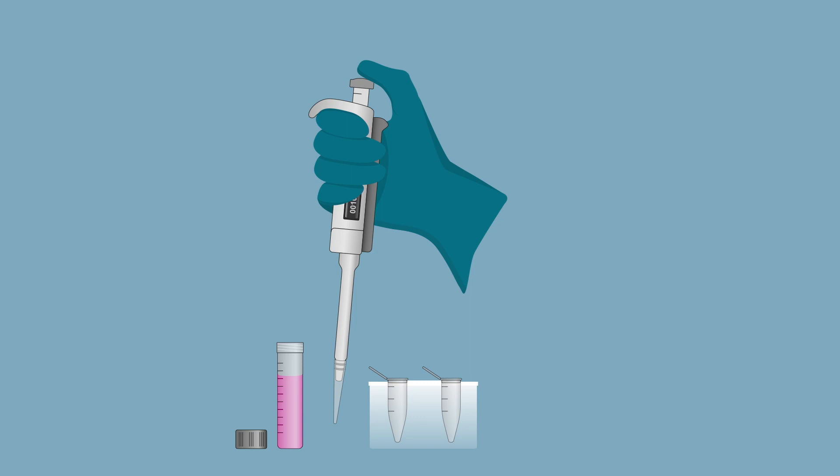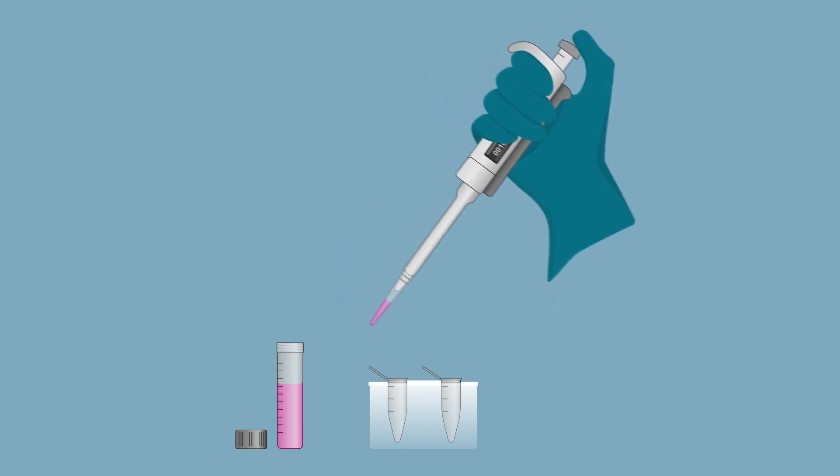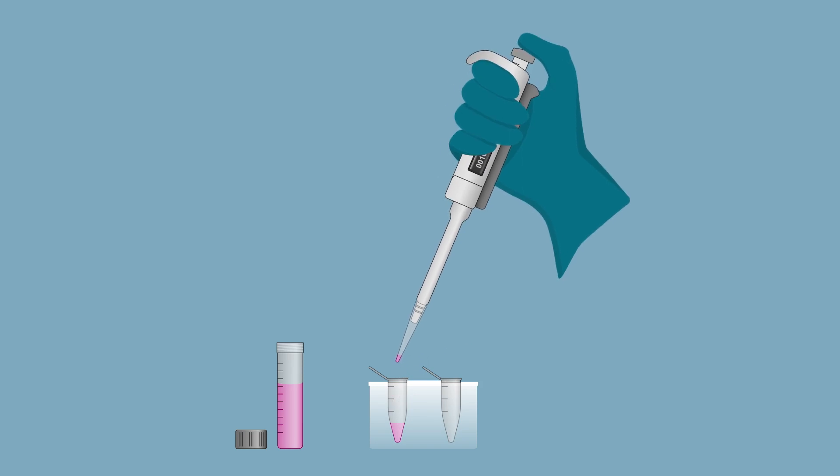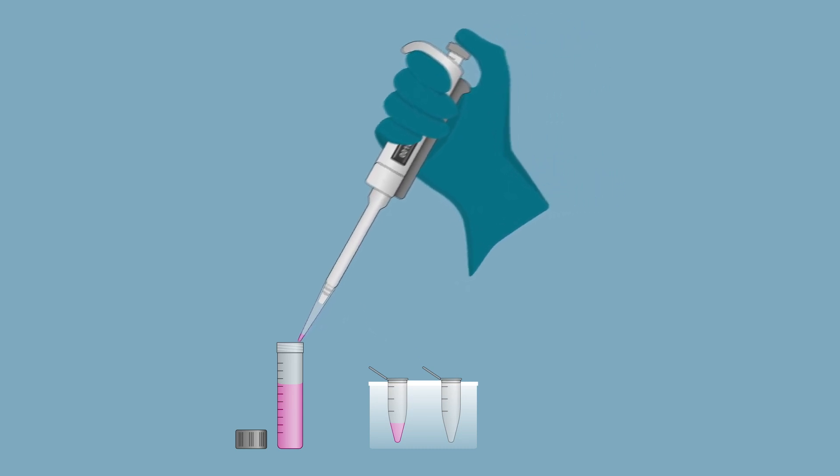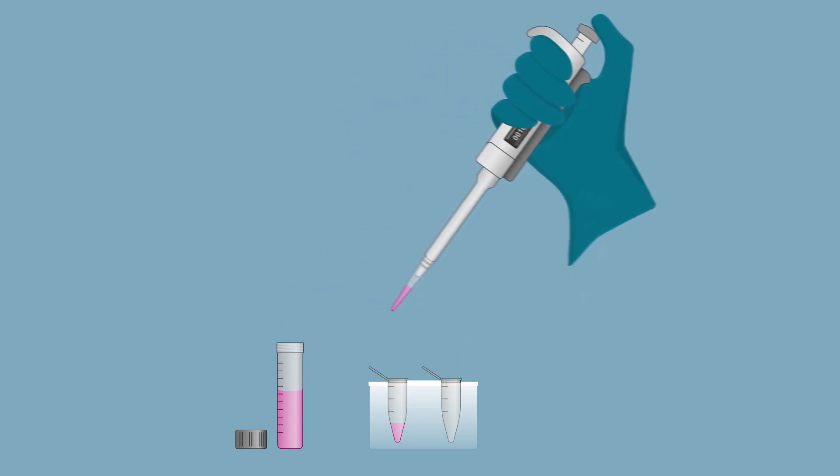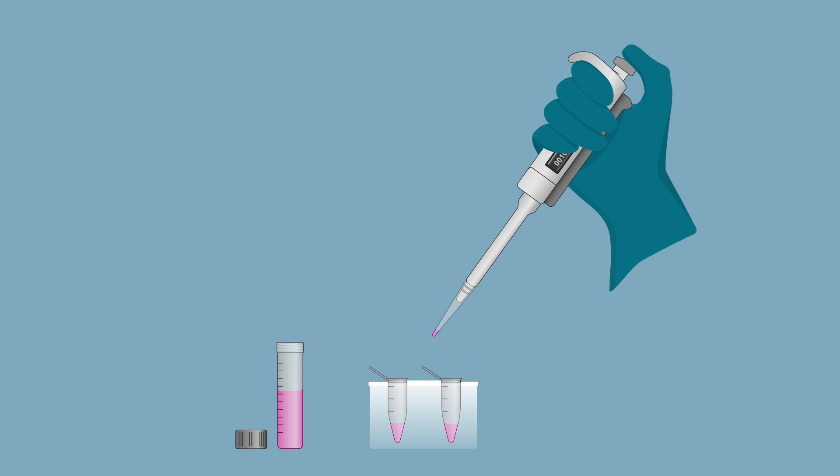Unlike for regular forward pipetting, before aspirating your liquid, push your plunger just past the first stop. Immerse your pipette tip into your liquid, just below the liquid surface. Slowly release your plunger all the way up. When dispensing your liquid, press down just until the first stop. A small volume will be left in your pipette tip. If using the same pipette tip to transfer your liquid to another well, keep your plunger pressed down to the first stop until you put the pipette tip back down in the liquid, and slowly release your plunger all the way up. Repeat as necessary. The small volume left in your pipette tip can be discarded once the pipetting is done.